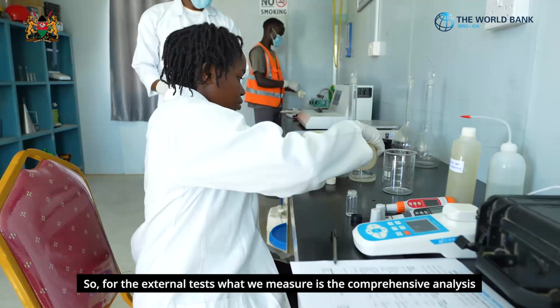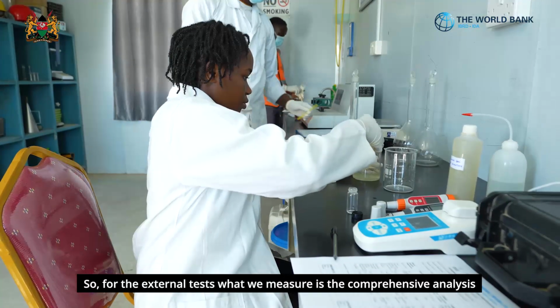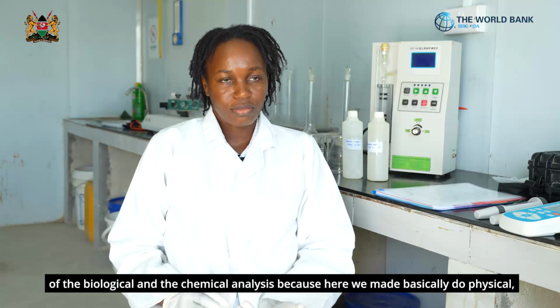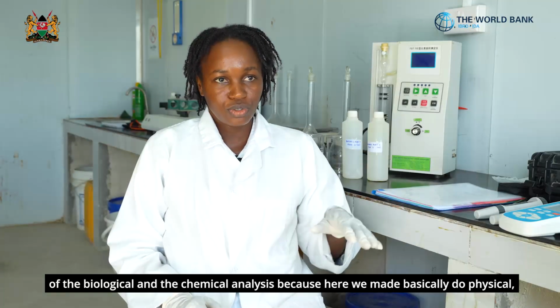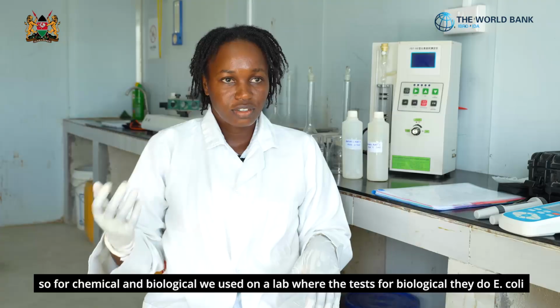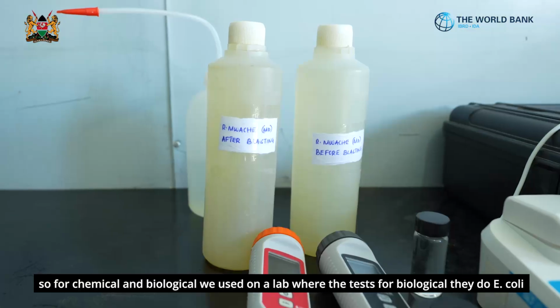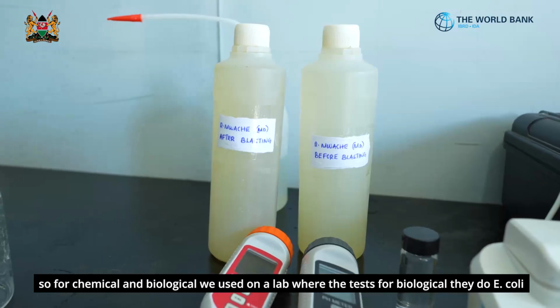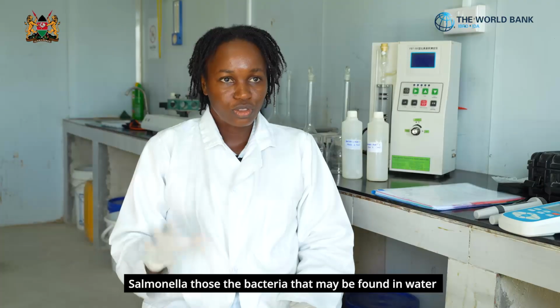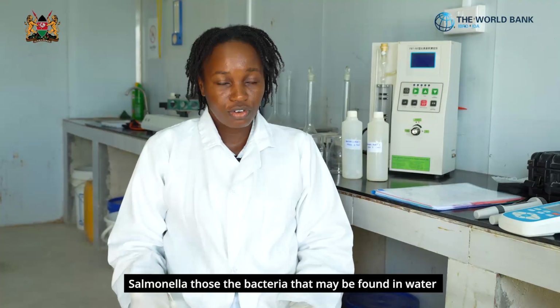So for the external tests, what we measure is a comprehensive analysis of the biological and the chemical analysis, because here we basically do physical. So for chemical and biological, we use zonal lab, where they test. For biological, they do E. coli, salmonella, the bacteria that may be found in water.